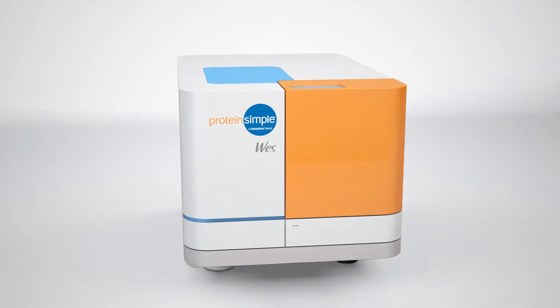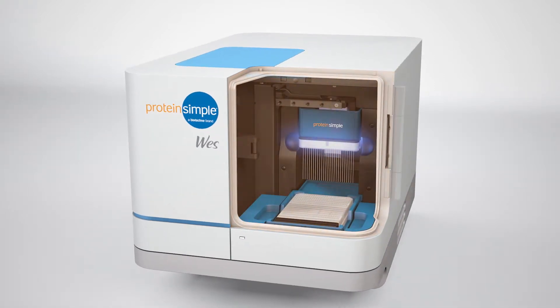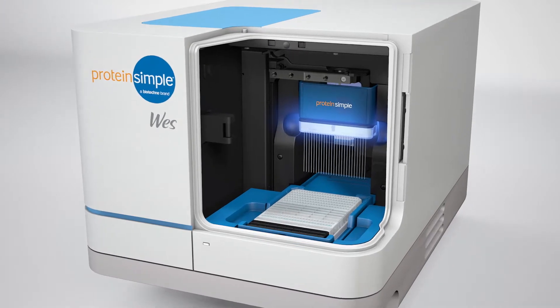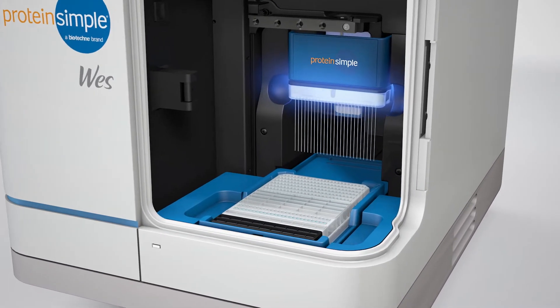Exactly how does Wes do Simple Westerns? The magic happens inside of a capillary. Each capillary cartridge can run either 13 or 25 capillaries, enabling throughput flexibility.